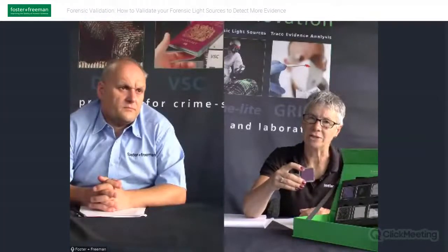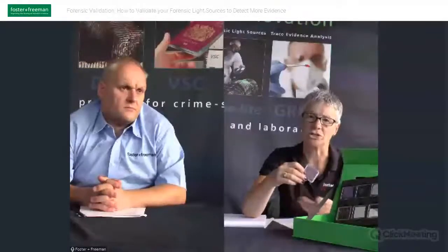A number of different papers have been published by people around the world, and there's some very good research that backs up why we're choosing the samples that we're choosing. So the paint over paint sample is based on a paper that talks about semen underneath paint. So it's based on actual research, independent of what we've done.